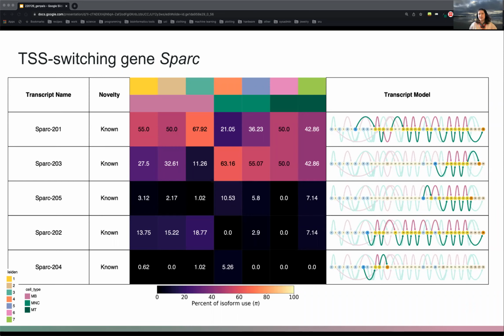So that's pretty interesting. And this is a plot that just comes right out of Swan, and there's a lot of different tunable parameters. I think it's really cool and pretty to look at. And I think it's publication ready, but maybe other people would think differently.